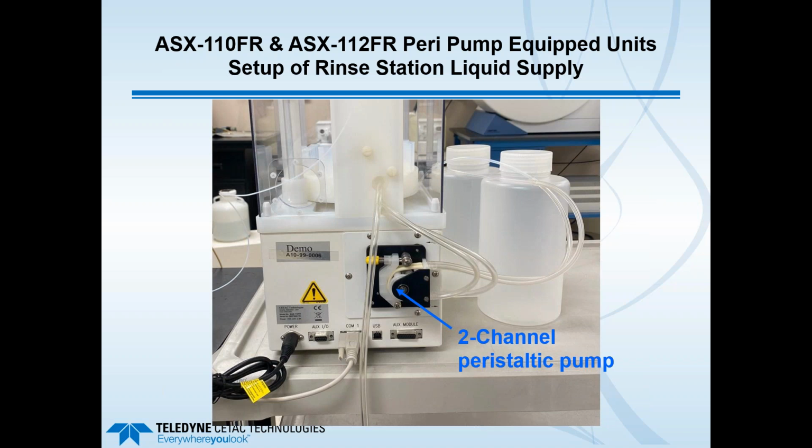Of course, again, you notice the PVC tube that leads down towards a waste receptacle.